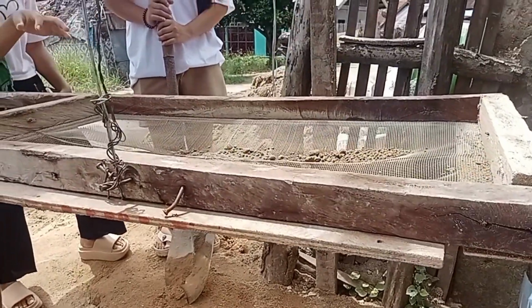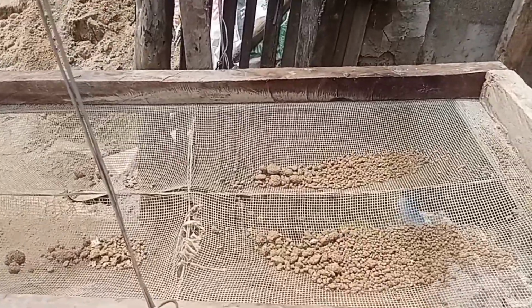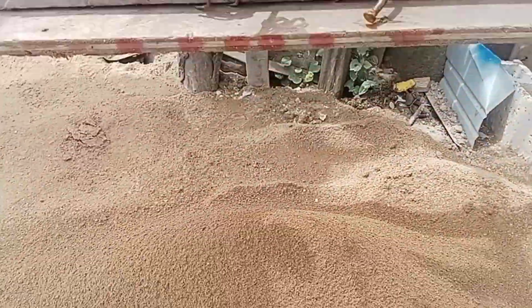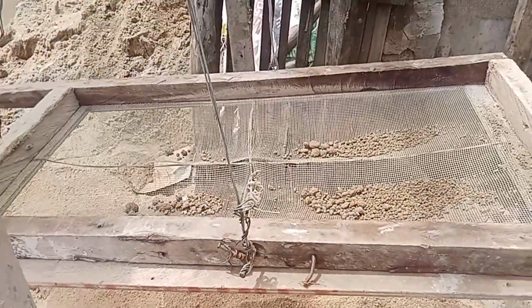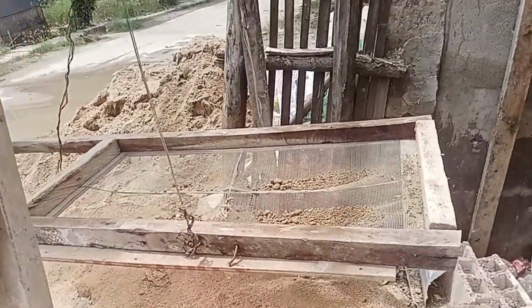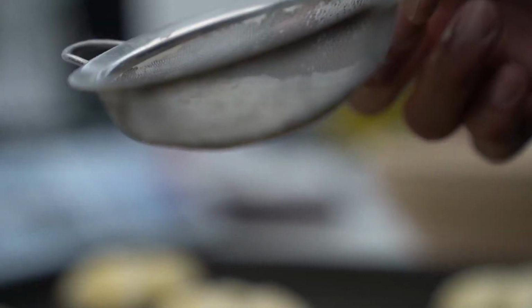This shows that sieving works because of the difference in particle size. The holes of the sieve allow only smaller particles to pass through while retaining the larger ones. Sieving is commonly used in construction to separate sand from pebbles, and in baking to remove lumps from flour.